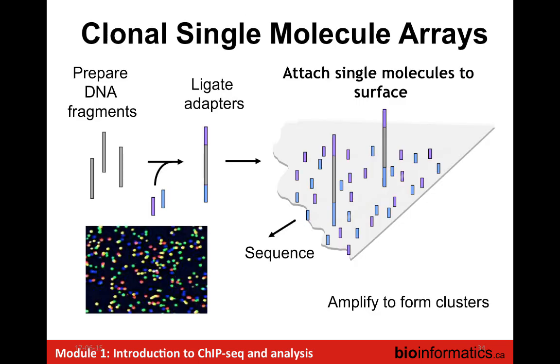Okay. So, of course, Illumina sequencing does clonal amplification on a solid surface, on a flow cell, on a solid piece of glass. There are other ways of clonally amplifying DNA molecules. What's the other predominant way in NGS to clonally amplify these fragments? The key characteristic of NGS sequencing. What's the other way that we do this? Anybody?